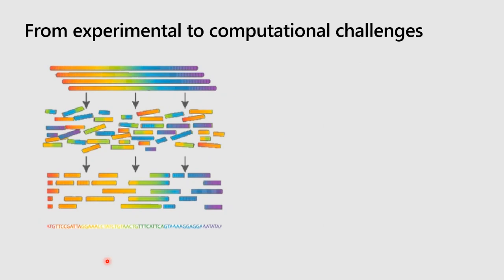This actually represents a huge computational challenge, and what we're doing every time we analyze an individual sample of DNA sequence data is look at between tens to hundreds to even thousands or millions of copies of DNA from a sample that are all randomly fragmented, because DNA sequencing instruments don't have the ability to read all 3.2 billion bases at once. So we have a random assortment of pieces of genome represented in our data set.